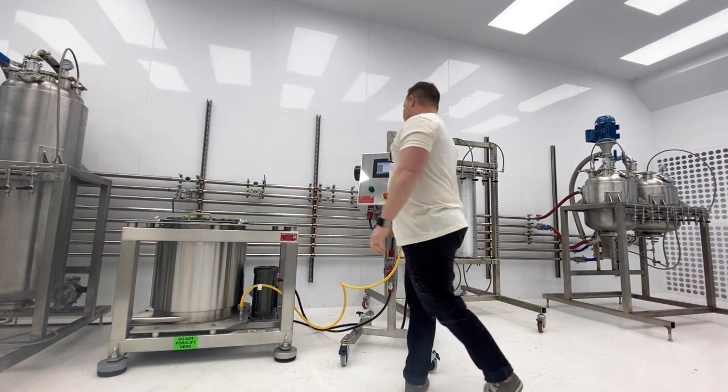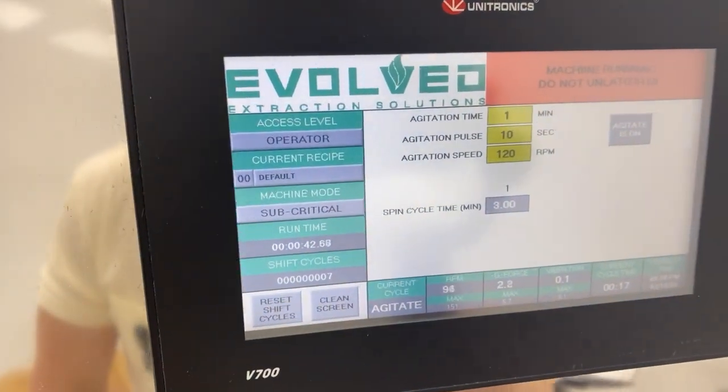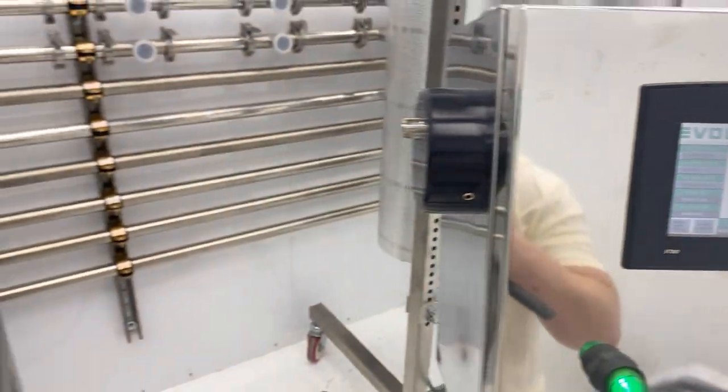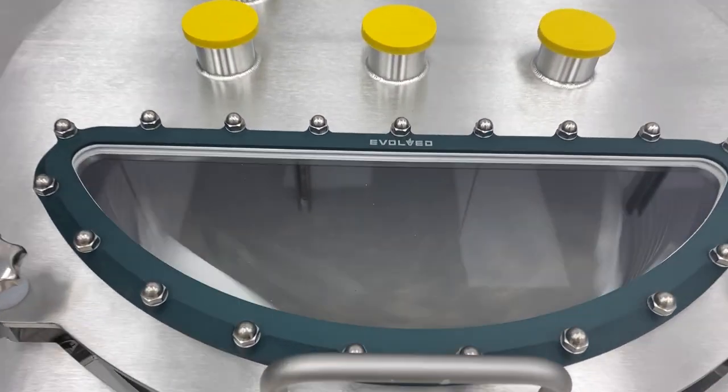Another key feature is multiple login credentials. We can have an operator who can't change or overwrite recipes, and an administrator who can do all of those sorts of things.